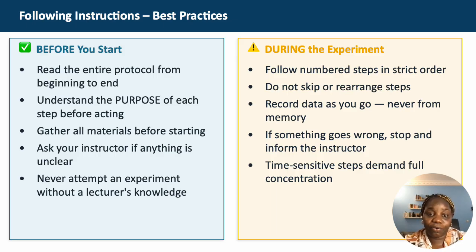Gather all materials before starting. So you have to have your list. Tick on your list if you have each of the materials that have been listed there. Do our groups have everything on our table before we start? Ask your instructor if anything is unclear regarding the protocol, the procedure, or a material. If you don't know, please ask. We are there for that. Never attempt an experiment without a lecturer's knowledge.